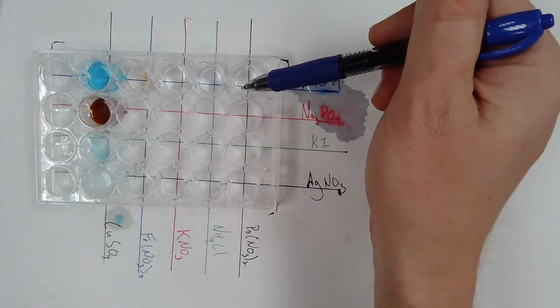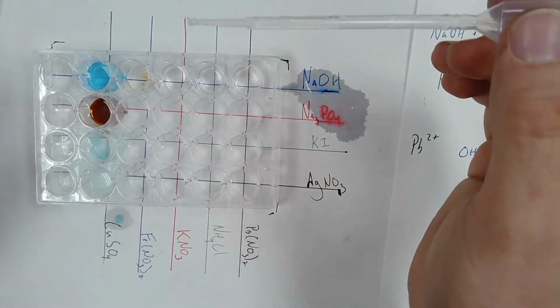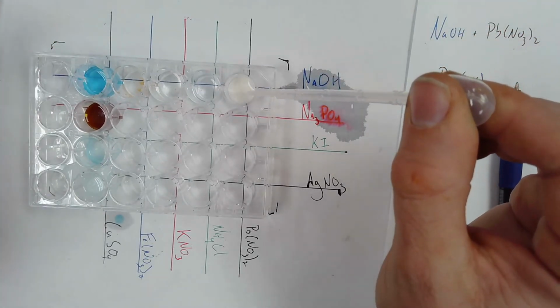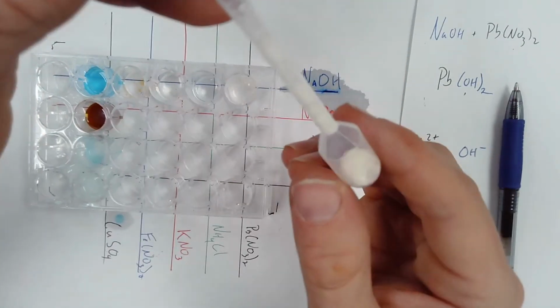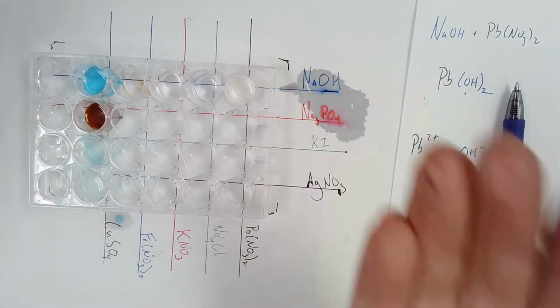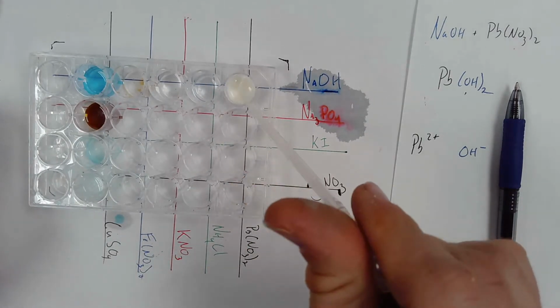All right, so I've got my lead nitrate here and my hydroxide here. So if I go over to the guide and I look, here's some lead. I'm going to add it here, and I should get a precipitate. Let's see what happens. Hey, look at that. It looks like milk, right? Again, I don't need to spin these all down, but very clearly this is a milky white precipitate. That is no longer transparent. You can't see my finger through it, right? We got our precipitate. Now, you've seen what we've done. We're working our way down, but we're starting to get better. We're able to predict it.